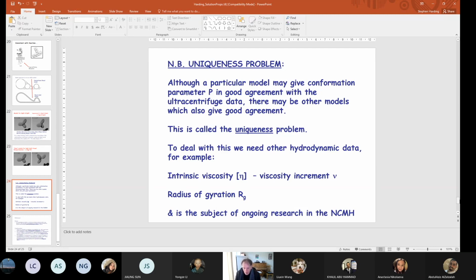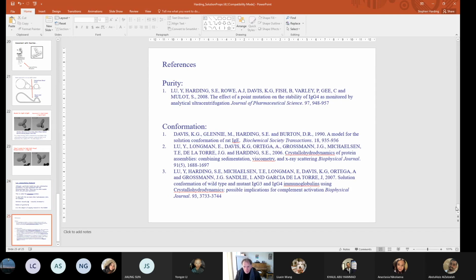And then to get around the uniqueness problem, we should really be comparing with other hydrodynamic data as well. But that's beyond what you are required to know for this course. But if you are interested, then you can look at these references here, which I've given you.